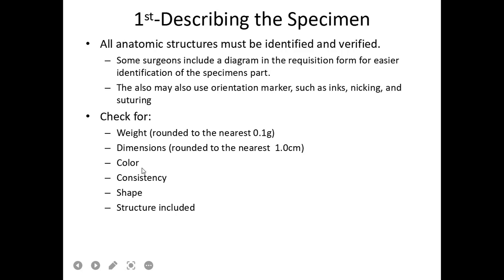Color, you need to be specific with the color. If that is red, what kind of red? If that is white, what kind of white? Like for example, for the red, baka dark red yan. Light red. Yung mga ganon. So, be specific.